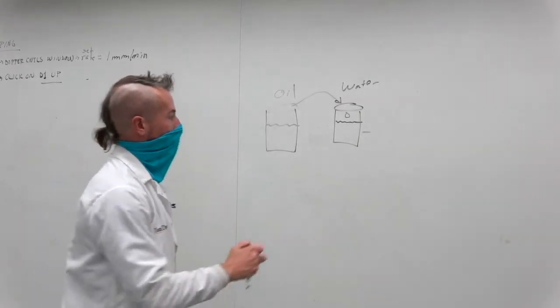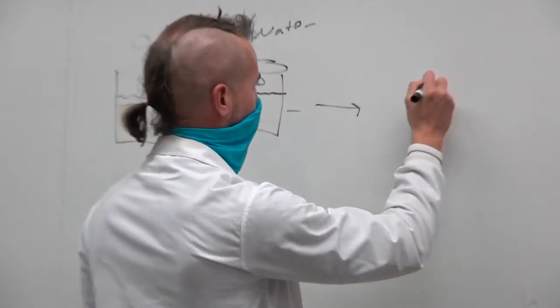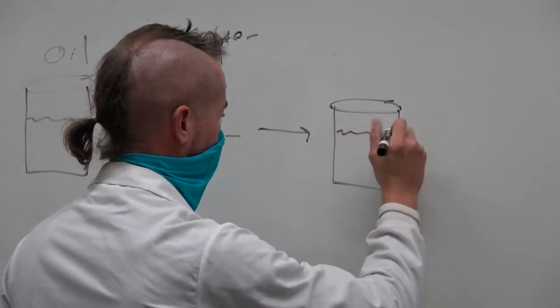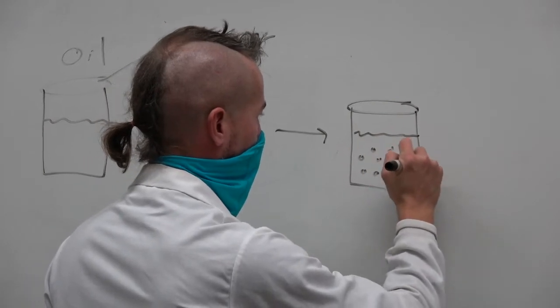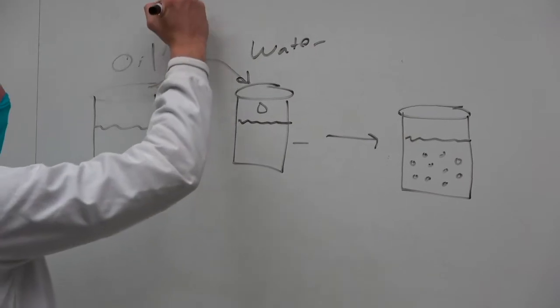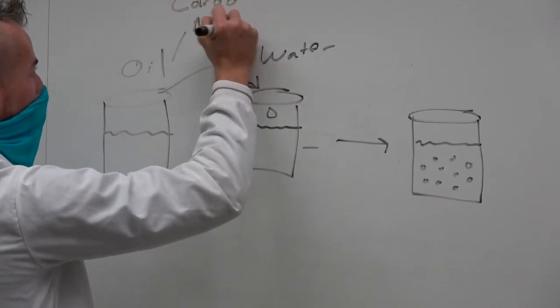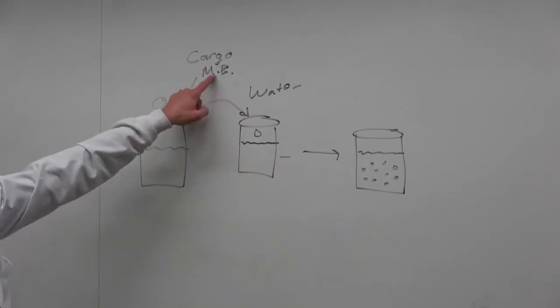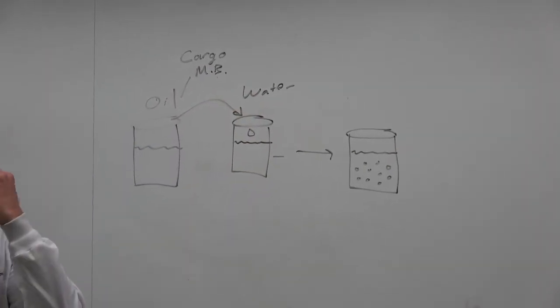Okay? But at the end of this, let's just talk about the nanoparticle case. We're going to end up with a batch of particles. Now remember, the oil has our cargo. It has our methylene blue. But I told you that this methylene blue also has some solubility in water.